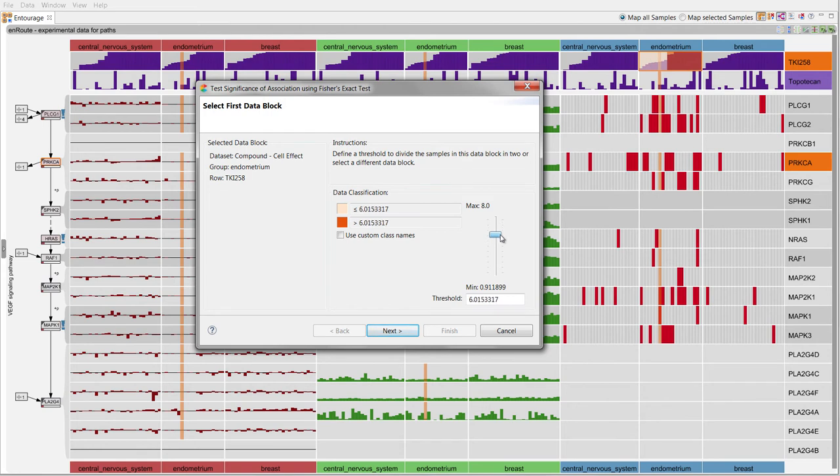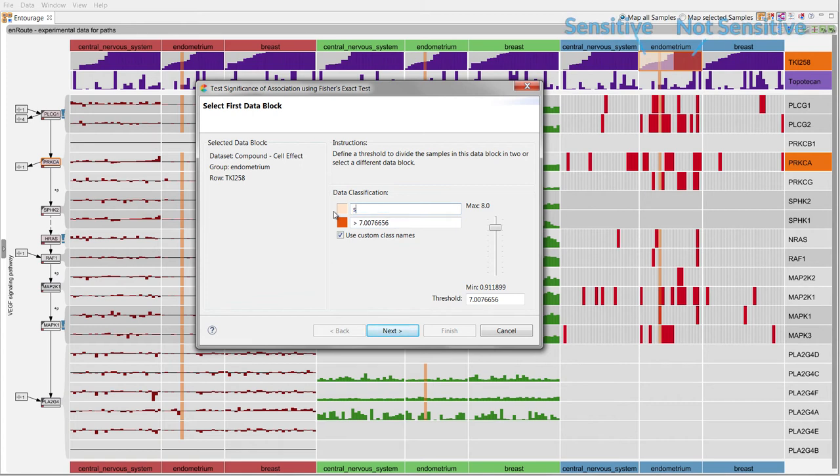The classification of samples is indicated as color overlays in the visualization. Samples with a light overlay are sensitive, those with a dark overlay are not sensitive to the drug.